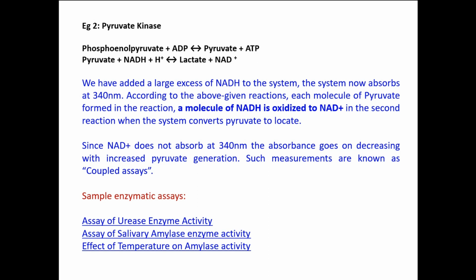And then later, when the pyruvate molecules are formed, automatically the pyruvate and NADH will react together, and then it forms lactate. So the NADH is getting depleted, and then it forms NAD plus.